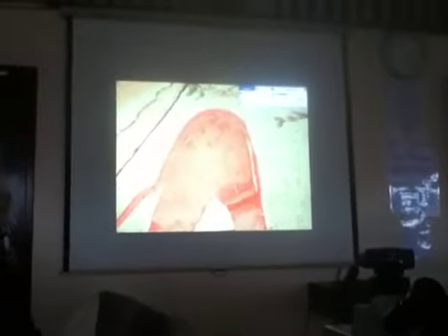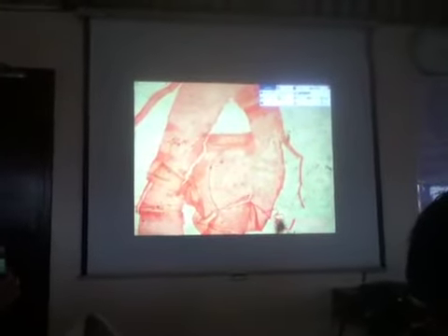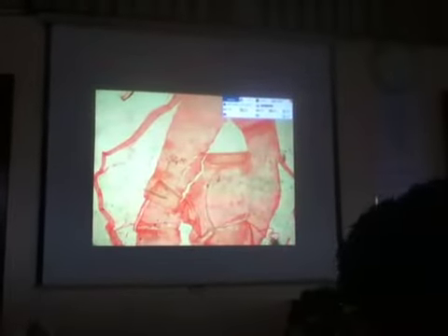The first thing that you should be able to locate and identify is that structure. Pink, which is actually oval in shape, however, that structure is already distorted during the preparation of the tissue. And so there are a lot of areas which are showing us a folding of its tissue. However, we can still appreciate the oval configuration of that structure, which is responsible for focusing the light which enters the eyeball. How do you call that structure?